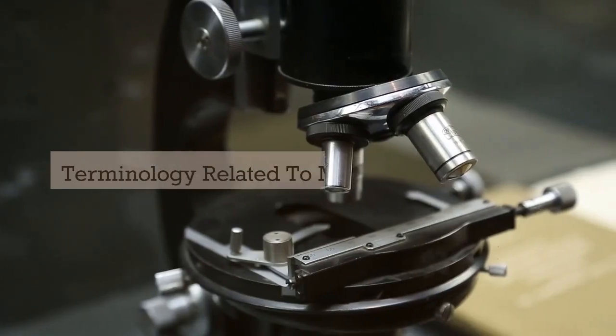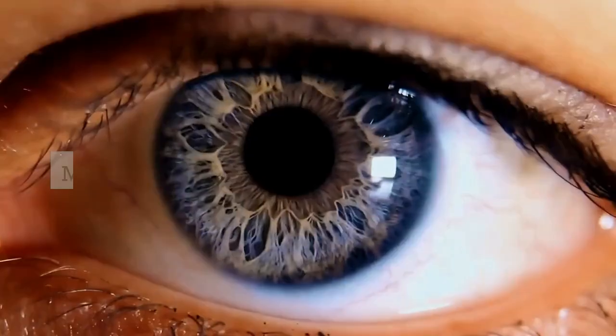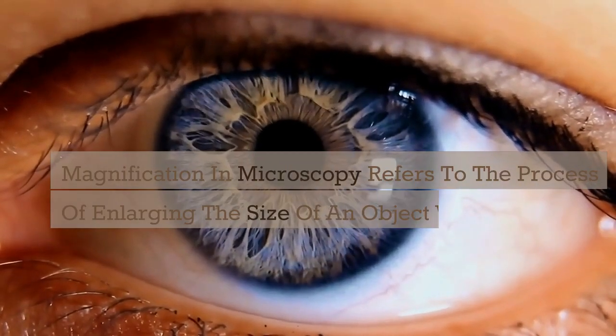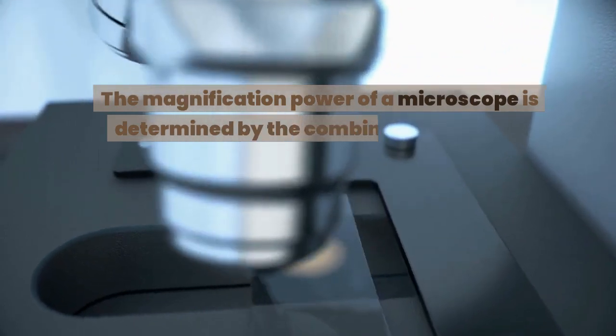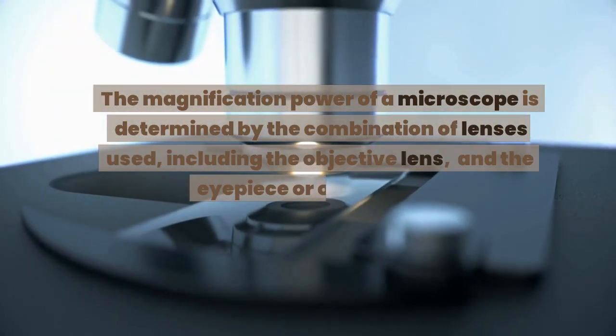Terminology related to microscopy. 1. Magnification in microscopy. Magnification in microscopy refers to the process of enlarging the size of an object when viewed through a microscope. The magnification power of a microscope is determined by the combination of lenses used, including the objective lens and the eyepiece or ocular lens.